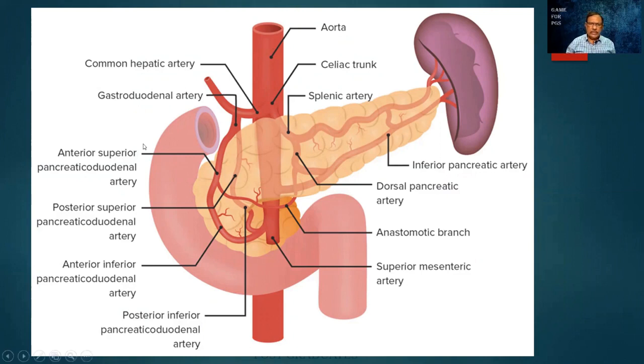And these are all the blood vessels. Have an idea about these blood vessels. The pancreas sitting comfortably within the folds of the duodenum, and the tail ending in the spleen. This relationship, even on the other day, there was a discussion in my college, and the various relationships were asked for, and we could not rattle them off that fluently. That is because we are lacking simple things first. So please do look at it. What are the major blood vessels, such as the splenic artery over here, and what are the segments of the intestine, what are the parts of the aorta or branches from which we are getting them.